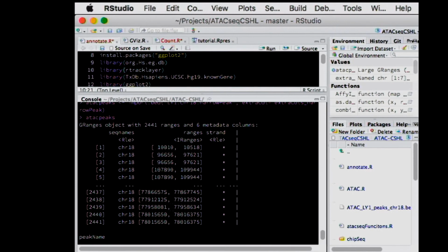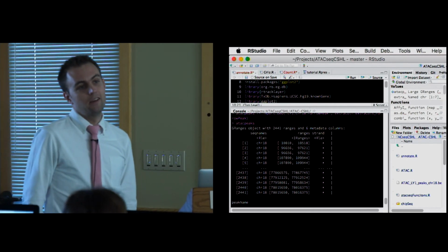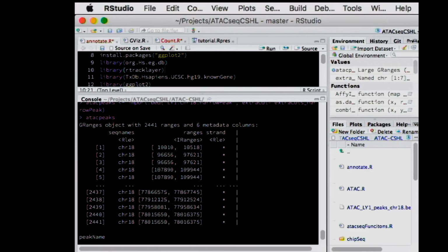So what do we expect to see in a file with peaks? Like what sort of information do we expect? Yeah, there'll be the indicated chromosome, there'll be areas that are peaks, right? How big is a peak going to be?